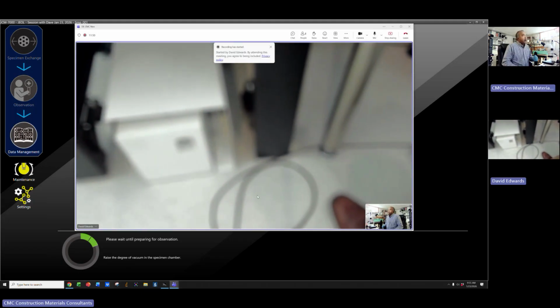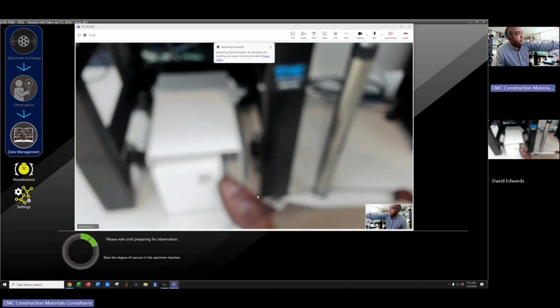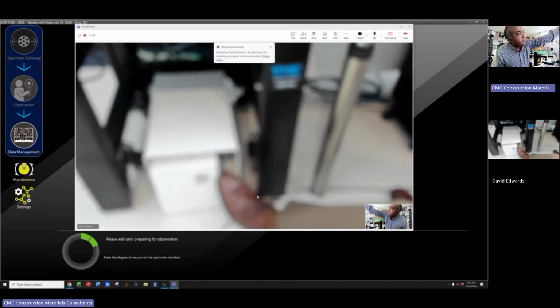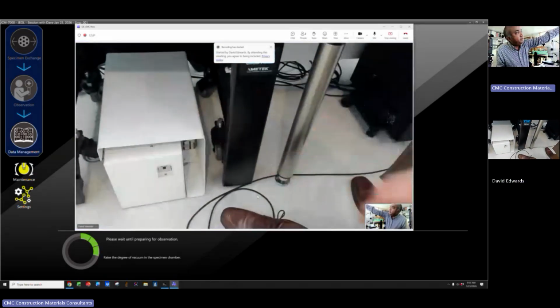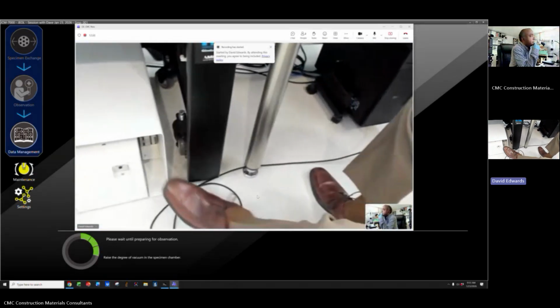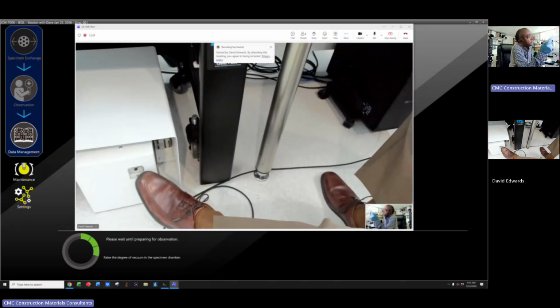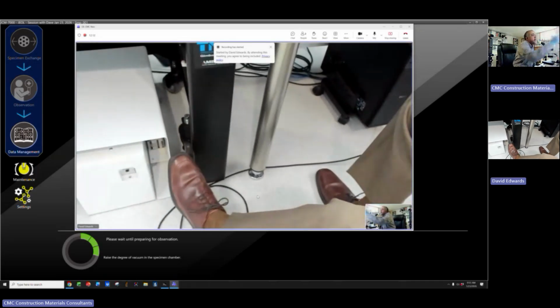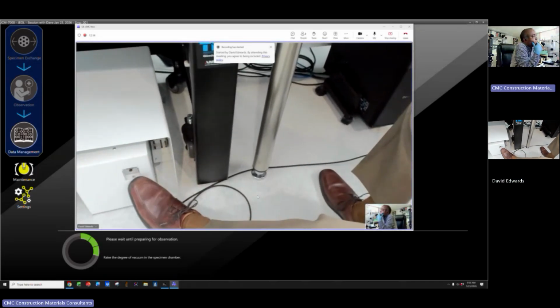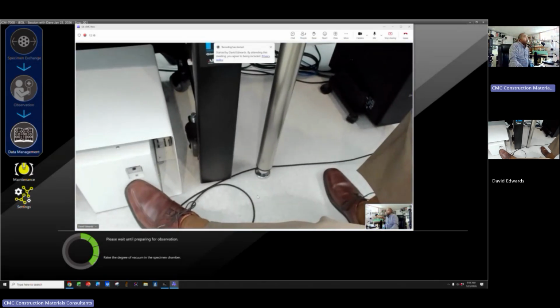So power off the box means that front button where the main power is, not the interior button of the EDS. There is another button on the right side of the control box. This button right here. Not just that, there is another one on the right side which you can reach with your finger, on the right side of that box, inside. Just this one. Okay, sounds good. So you want me to do that now?